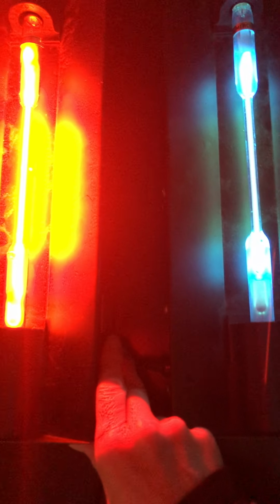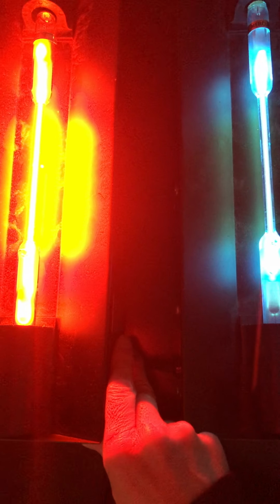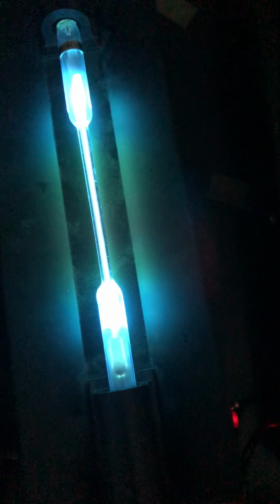I'm looking for the one that's emitting on average more high energy colors. And so then I'd be going with the mercury. I see more of the blues and violets and even a little bit of, there it is, even a little bit of that cool green color. But on average, these are higher energy colors as opposed to maybe the reds and orange and yellows that I would see from neon.